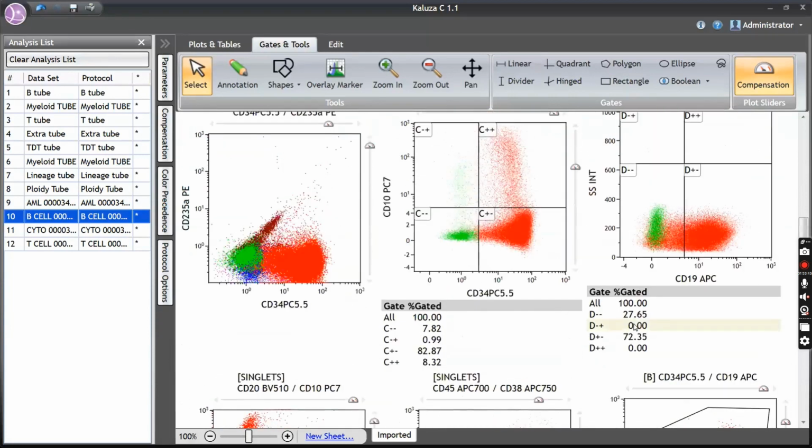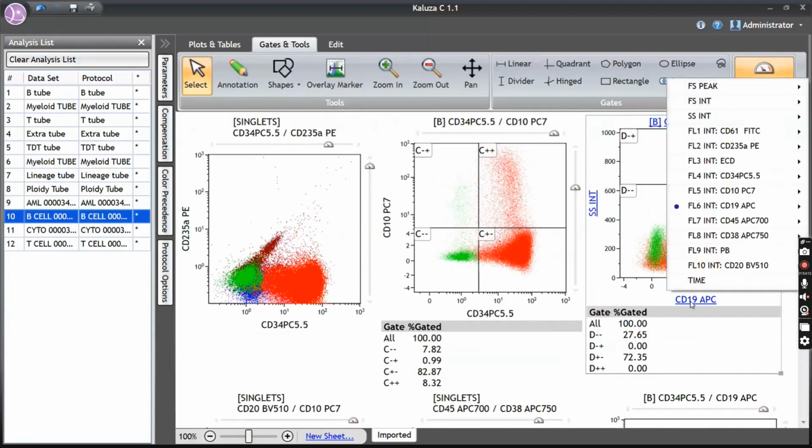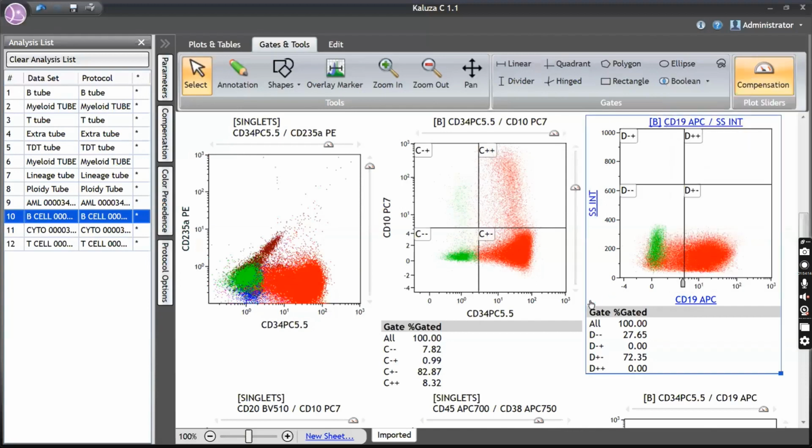Yeah, so the criteria, as we discussed yesterday, to call it B, it should be bright 19 with at least one marker, CD79A or CD22. Or if it is a dim CD19, as in this case, you need two markers like CD10, CD22 or CD79A. Okay, so we need now two markers apart from 19. 10 is there, but it is only in a subset. So I'll take that, but still I'd love to look at other markers like CD22, which is not here.